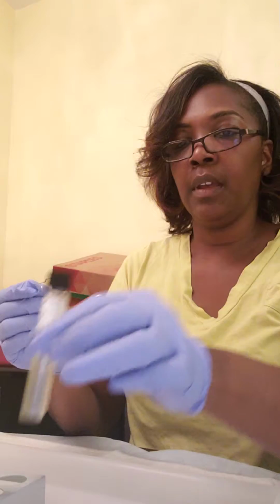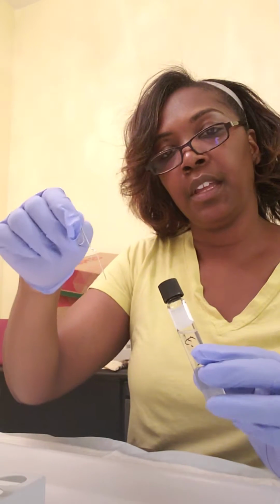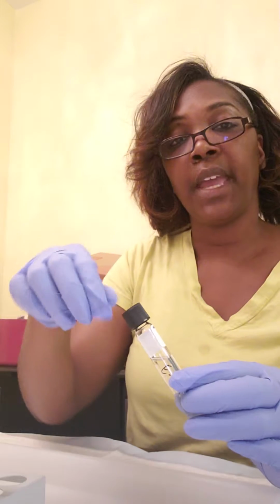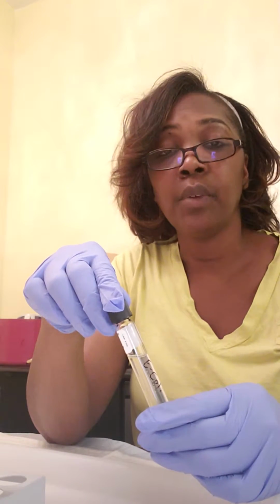In the same motion, for the epidermidis, of course, I unscrewed the cap, sterilized it over a flame for 5 seconds, took that same paper clip, jammed it inside without wiggling it around, pulled it out, ran it over the flame again to sterilize the lid of the tube, screwed the cap back on, and I let my samples incubate for 72 hours.